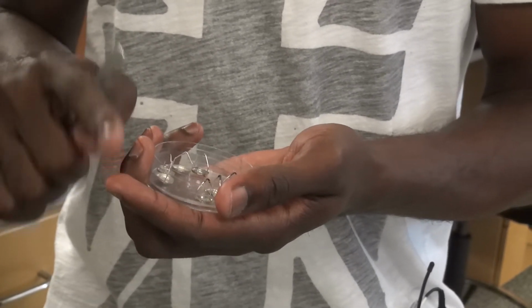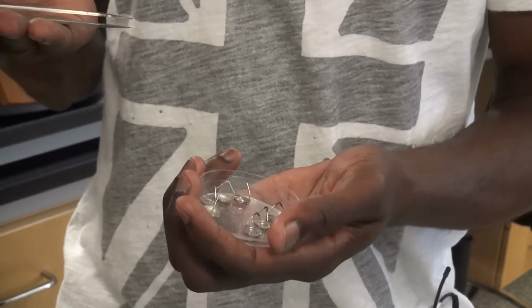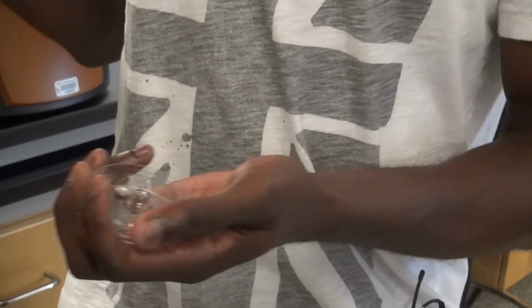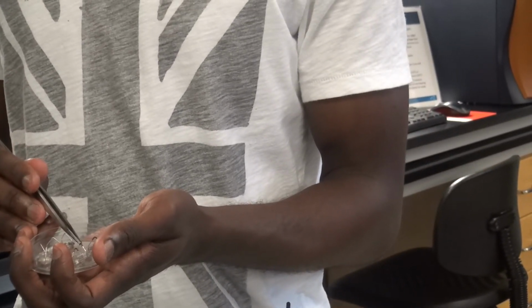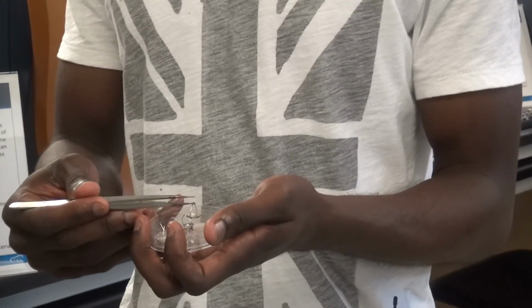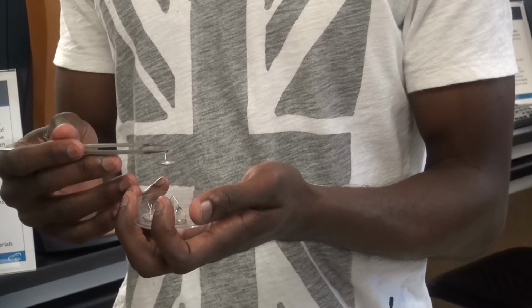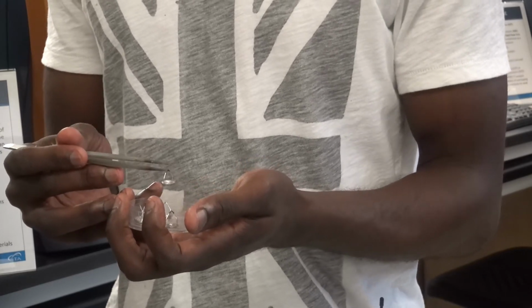And when they stick together, they can have a problem removing the pan from the hook itself. And that actually can cause spillage. It can cause the pan to fall into the furnace, which basically causes a lot of other problems. So basically their solution to that was adding this black alloy to the top of the pan so that when the hook is under it and it's suspended, there will be no sticking of the pan to the hook, and therefore these are rated up to 1,000 degrees Celsius.